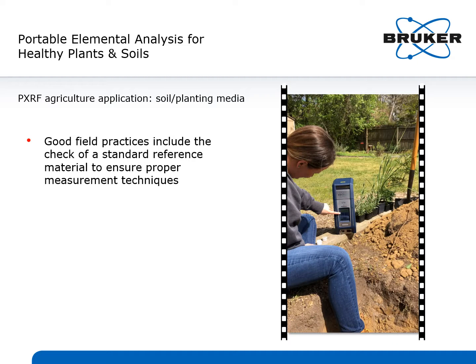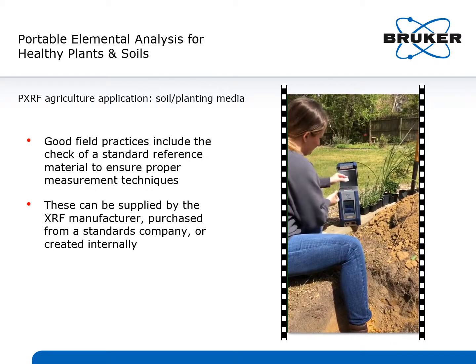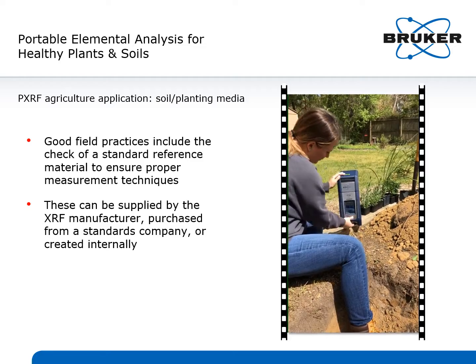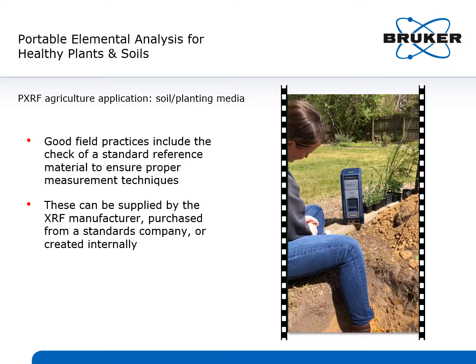One thing field scientists should keep on hand when measuring unknown soils is 1 or 2 reference samples with known concentrations. This helps ensure the overall measurement technique is in good working order. Most portable XRF manufacturers provide reference standards, but they can also be purchased from other resources or developed internally. The important thing is to have some known samples on hand in case questions come up.